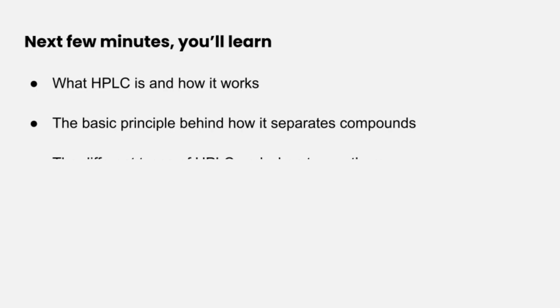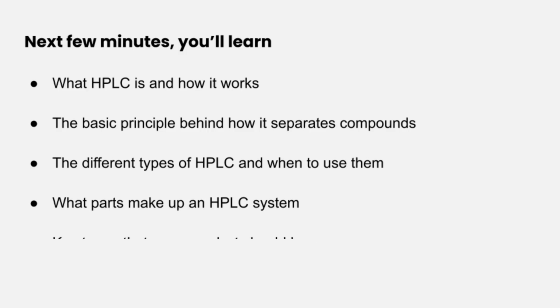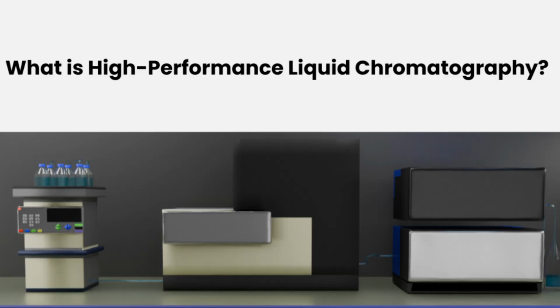In the next few minutes, you will learn the basic principle behind how it separates the compounds, the different types of HPLC and when to use them, what parts make up the HPLC system, key terms that every analyst should know, and finally, how HPLC is used in the real world. Let's get started with the basics.